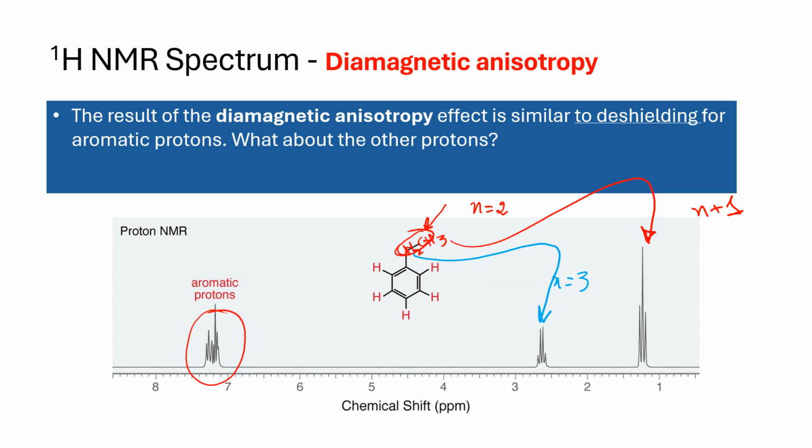So these are patterns that we need to remember. But the point is grouping all of the aromatics together. They're not identical. And the fact that it's complex is because here you have, for example, types A, B, and C because of symmetry. So the A signal is due to 2 H's, and it is a doublet. As you can see, it is within 3 bonds, so it couples to that. So it is a doublet. And proton B is complex, so it will be a doublet of doublets.